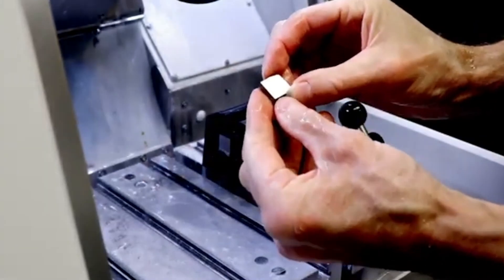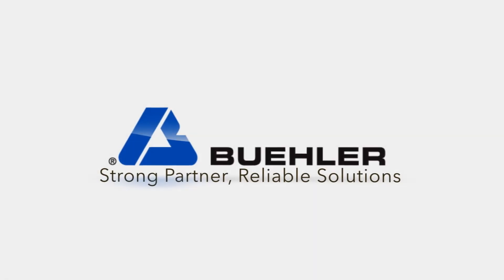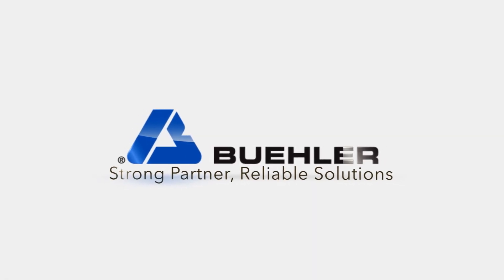After cutting through a sample with a manual cutter, slowly lift the blade out of the sample. For more information, please visit www.buehler.com.